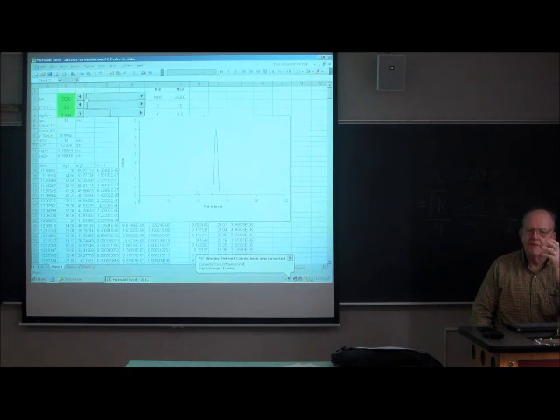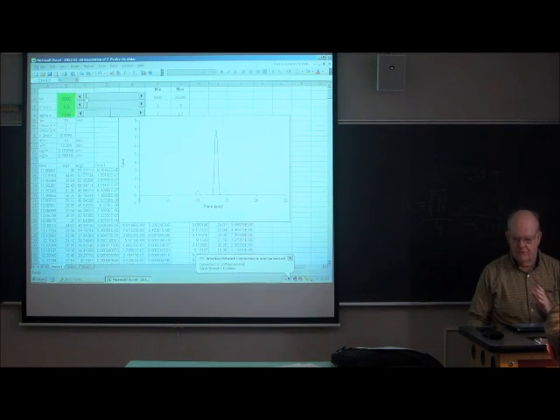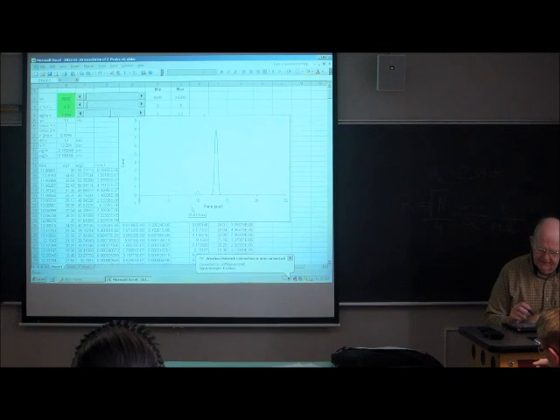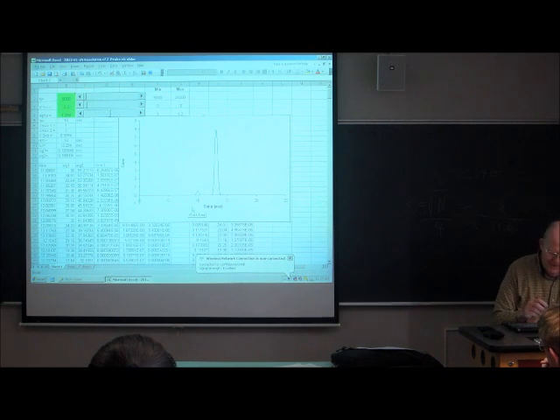In LC, we usually have to add something to the sample to see the dead time, the dead volume. And a compound like uracil, which is really water soluble and has no charge on it, would be essentially unretained. So we just want to know where the dead time of the column is when we look at a chromatogram. It's really important to know where the dead time is. So the first little peak is a dead time marker peak, and then the second peak, well, it's the second peak. And we'll see if it's one or two peaks.